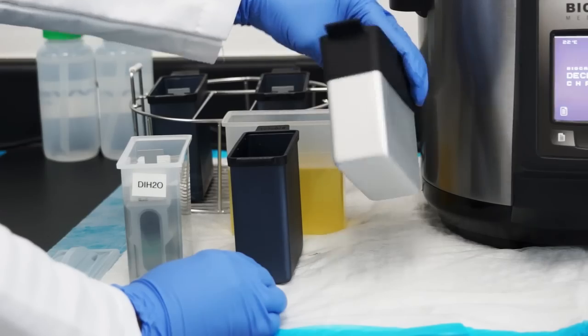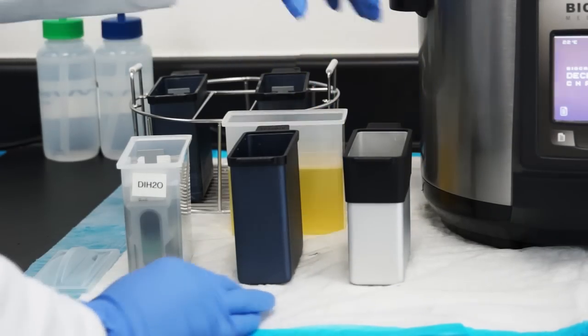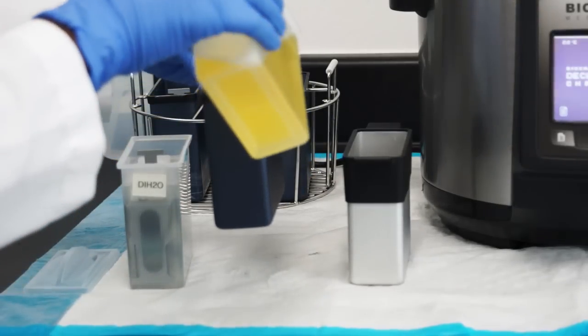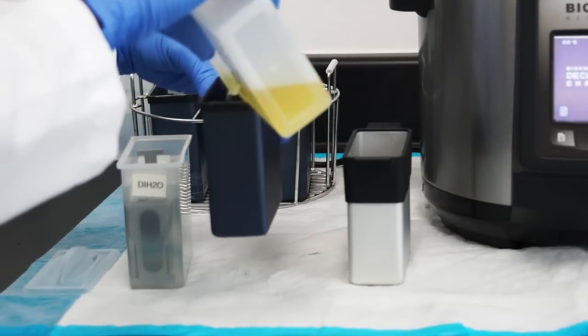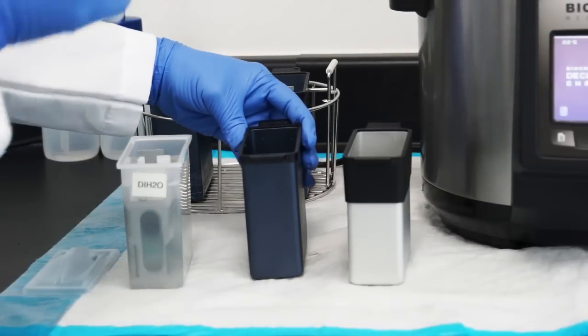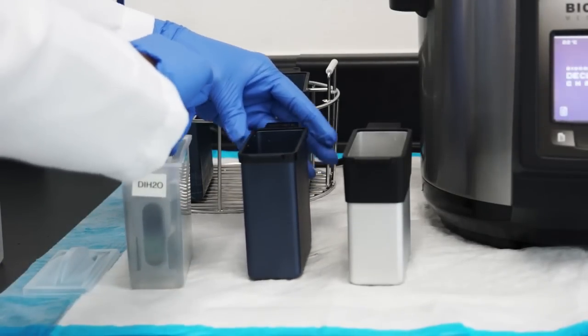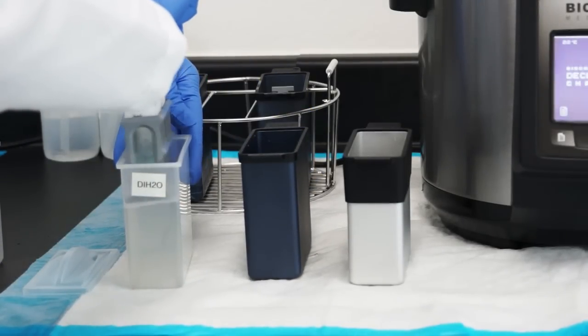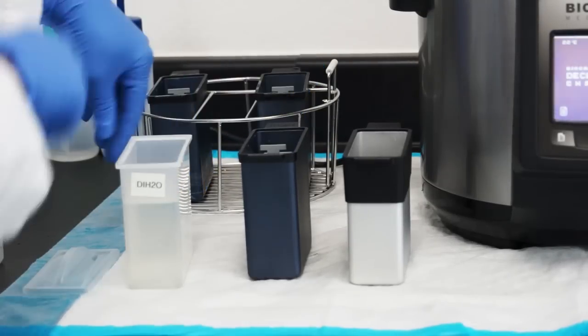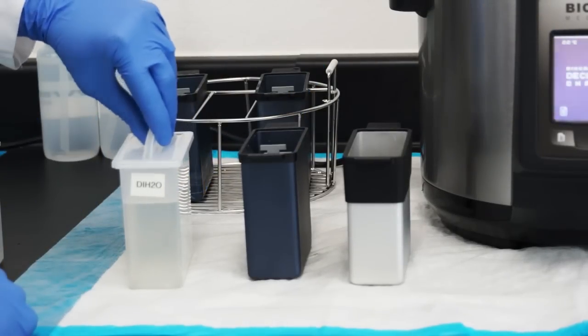There are two types of metal slide canisters available for the decloaking chamber next-gen. Despite the different handle lengths and exterior colors, both types of aluminum canisters provide rapid and even heat transfer from the unit's heating elements to the retrieval solutions and the slide-mounted tissue sections. For best results, use at least 200 milliliters of retrieval solution in the metal canisters.